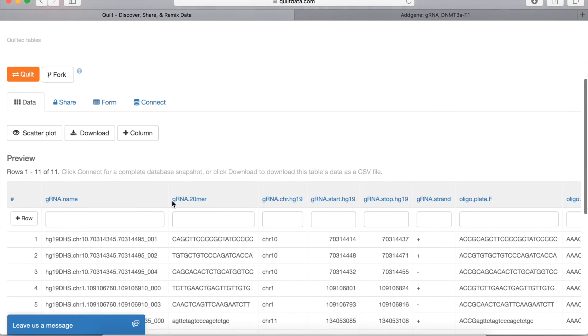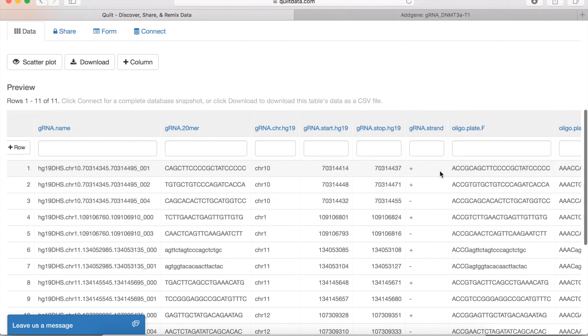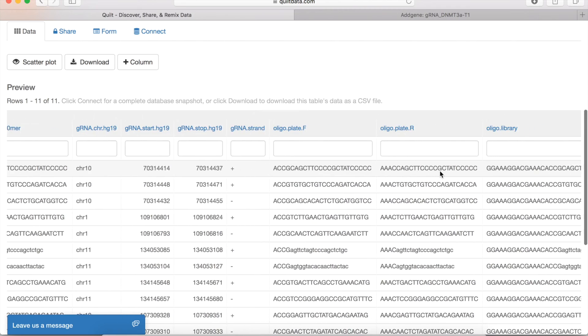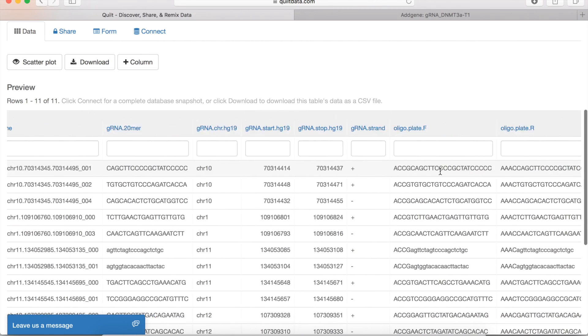What comes back after a quick search are the guide RNAs themselves, the location of the guide RNA in the genome, the strand they target, and then the oligos as well.